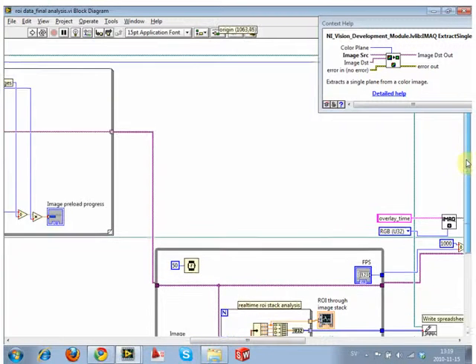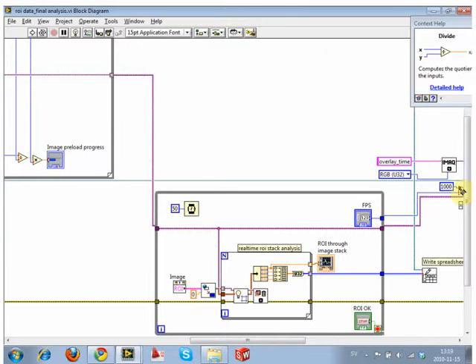So when you're doing intensity measurements, it essentially is going to look at some pixel value. Each pixel has a value associated with it, generally 8-bit pixels, 0 to 255. That's what they have. A color image has that in at least 3 channels, sometimes 4 channels. So you need to tell it which channel to look at.